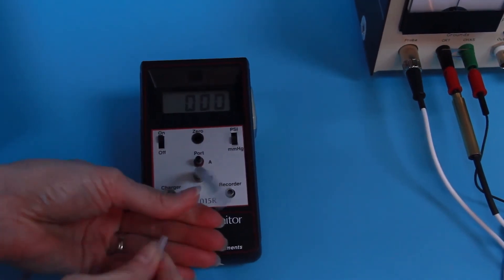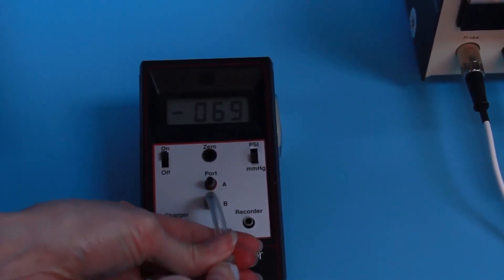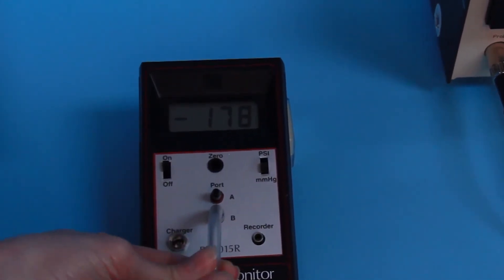Then connect the vacuum source to port B on the meter to monitor the vacuum. Regulate the vacuum up or down until the manometer reads approximately negative 150.